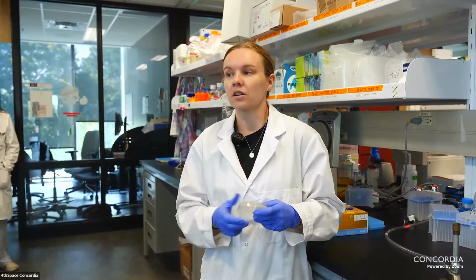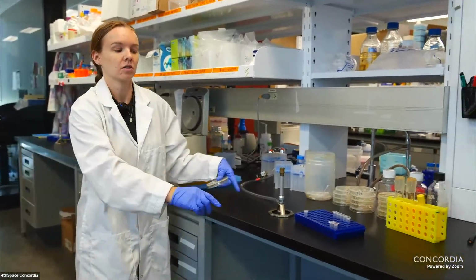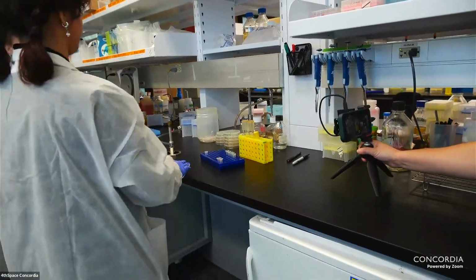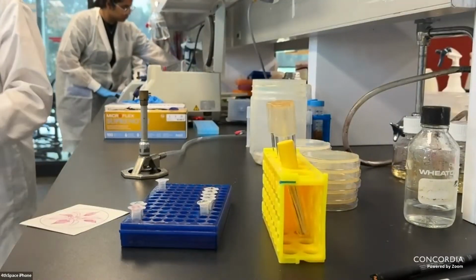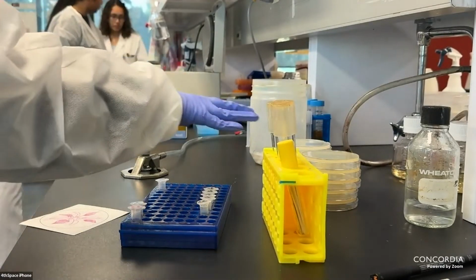So yeah, any questions before we start? No? Okay, so we can do 2 at one station and 1 at the other. So you can just go on either side of the flame here. And once you guys are done, please put your gloves in the biohazard waste over there, the yellow bin. Don't throw your gloves out in the normal garbage. That's it. Okay. And yeah, if you have any questions, just let us know.